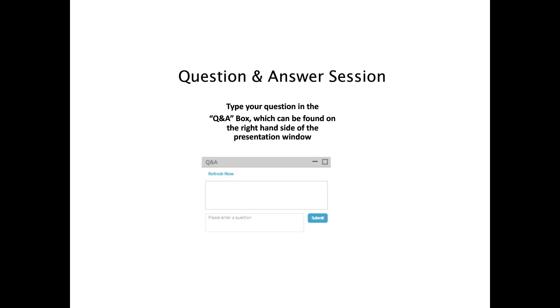Here's our first question. What applications are used for proteins and antibodies? So I'll field that one. In the presentation, we focused mostly on polymers because that's the majority of viscometry applications. But we also have beautiful data for proteins and antibodies, both in standard chromatography and with UHPLC. So it's a fine application for both, and it's a very good way of measuring the hydrodynamic volume or hydrodynamic radius for things that are too small to easily resolve with dynamic light scattering.